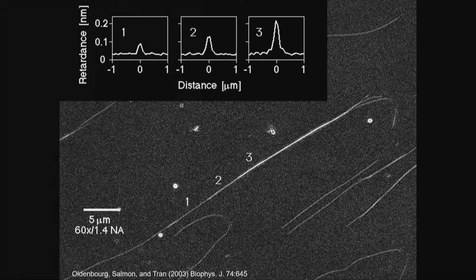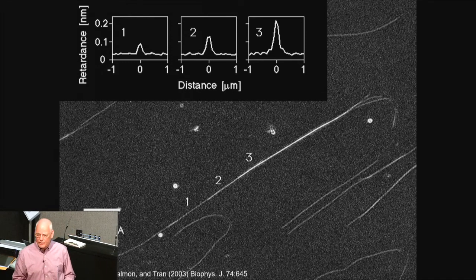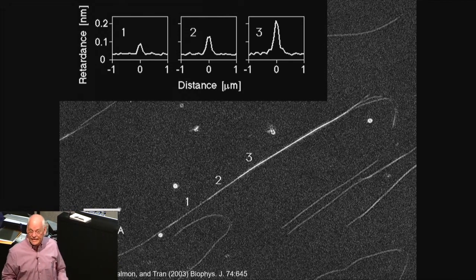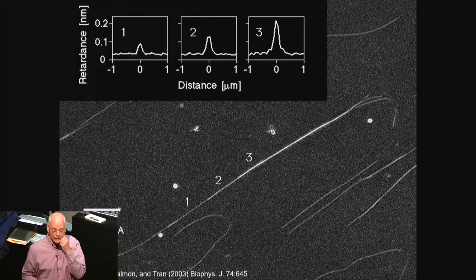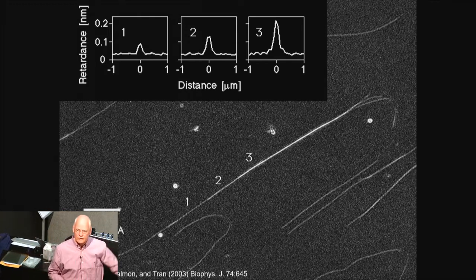You see that the imaging is really limited by the numerical aperture, that is by the angular range over which you collect the scattering from this. And in the end, it's a scattering problem. It doesn't really make sense to talk about a refractive index of an object that's 25 nanometer thick. The wavelength of light is 500 nanometer, and usually a refractive index is something that is averaged over several wavelengths.